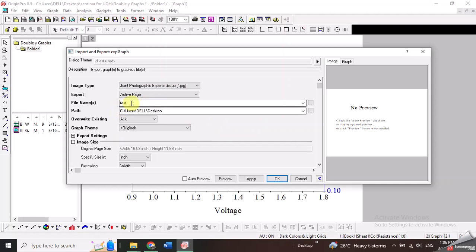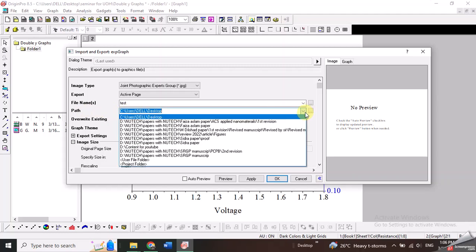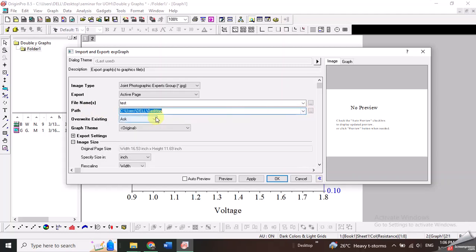Secondly you just need to give the name of your file and then give the path where you want to save your image. I have selected the desktop where my image will be saved when I convert it.